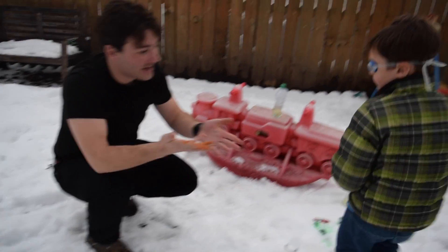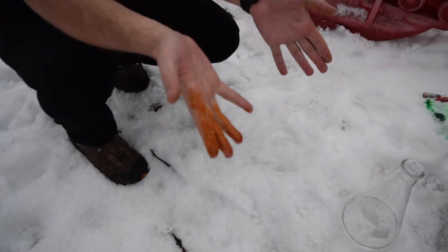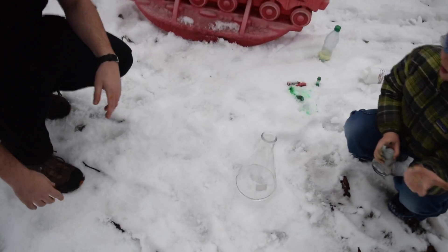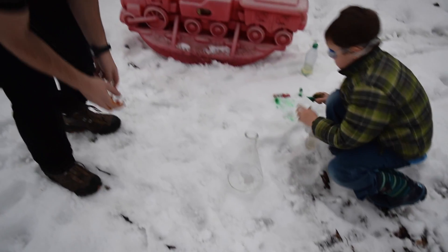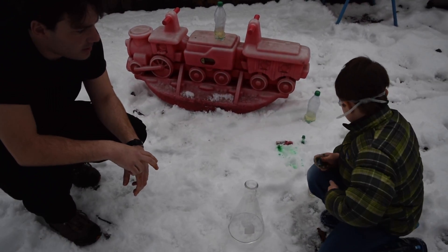You can see the hydrogen peroxide is staining my hands kind of brown. It'll come off. And now let's put some food coloring in. Why don't we do one green and one red? I thought it would be green. Yeah.